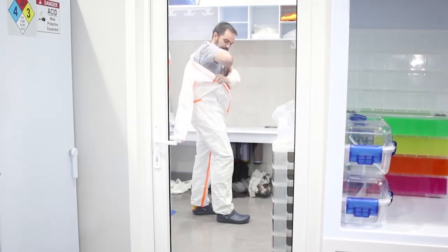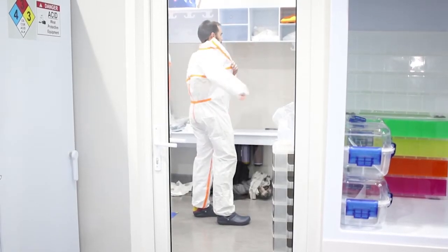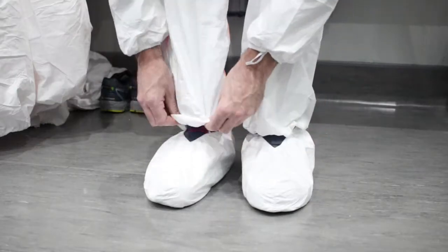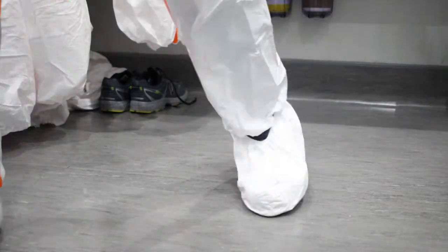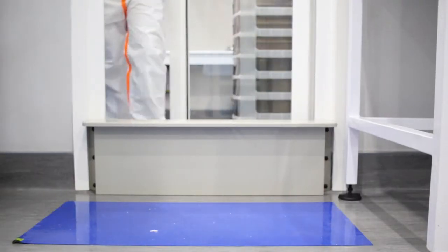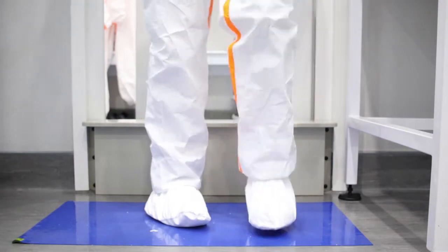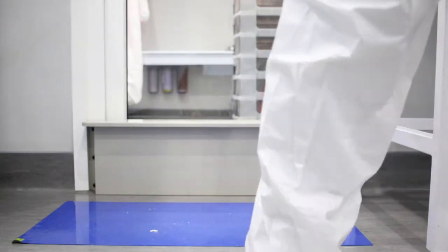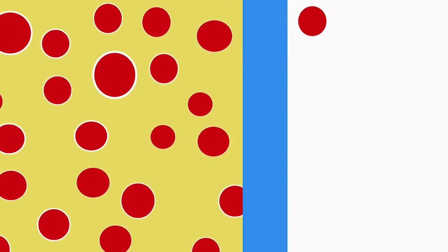So what makes the WIGL really unique is the fact that it is an exceptionally clean environment. Our ultimate goal in this laboratory is to reduce contamination to its utmost minimum so that we can measure the isotopic composition of only the rocks and the fossils and other earth materials that we are interested in. We go from outside air with a million particles per cubic foot down to the cleanest environments with less than 10 particles per cubic foot.